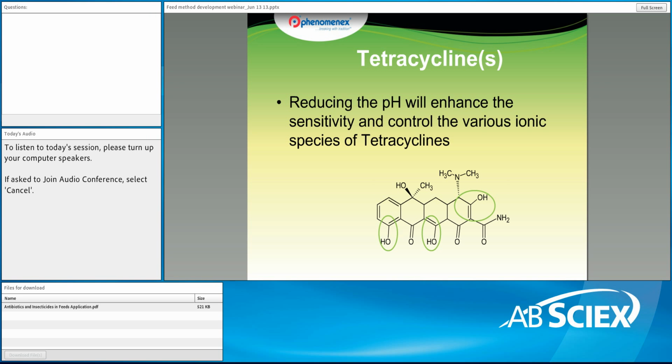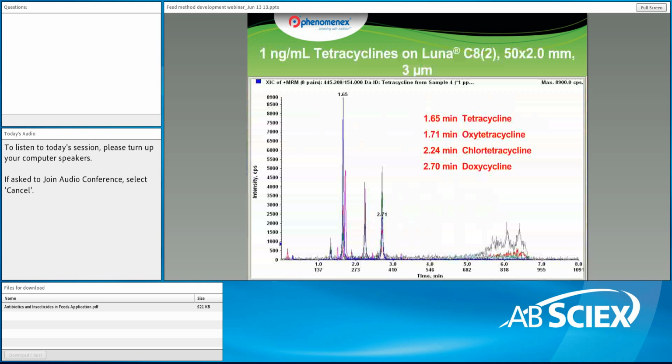There are also a number of functional groups, 2 enols and a phenol group, that can act as acid. Those protons can leave and form a negatively charged species that would counteract the charge that might be on the other side of the molecule, hence losing sensitivity because of this behavior.